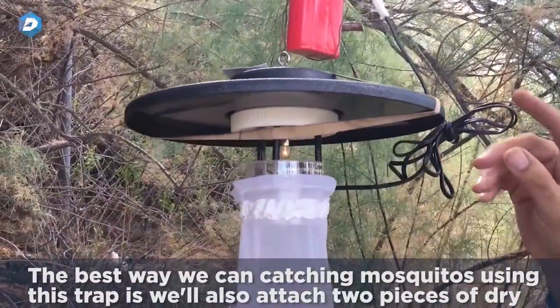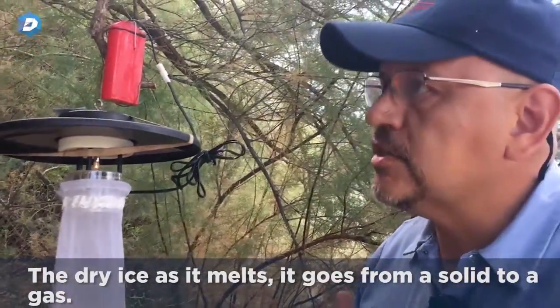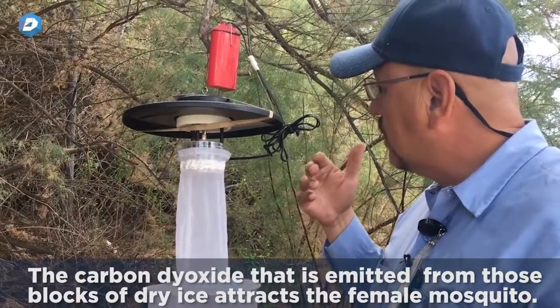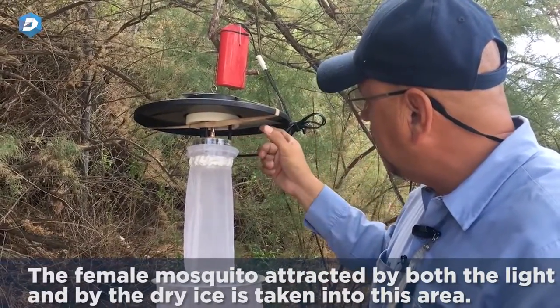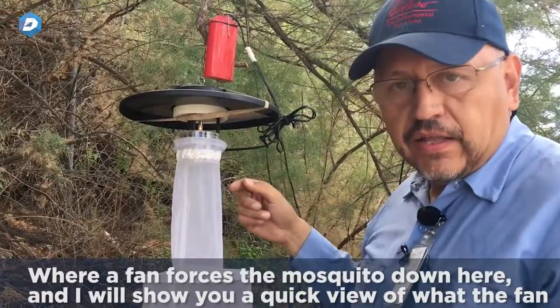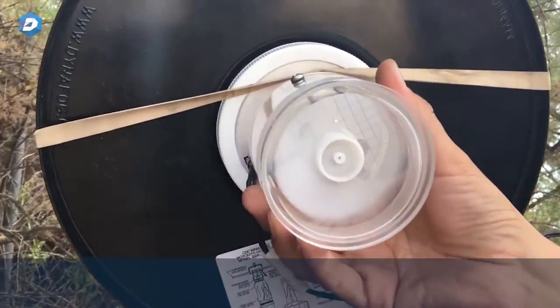The best way we can catch mosquitoes using this trap is we'll attach two pieces of dry ice. As the dry ice melts, it goes from a solid to a gas, and the carbon dioxide emitted from those blocks attracts the female mosquito. The female mosquito, attracted by both the light and the dry ice, is taken into this area where a fan forces her down.